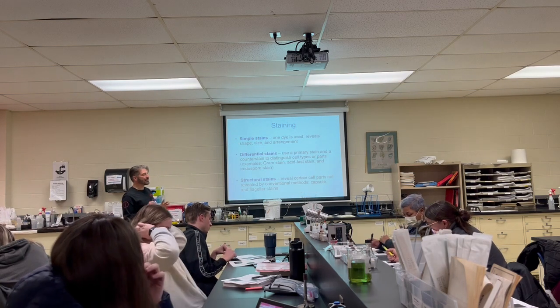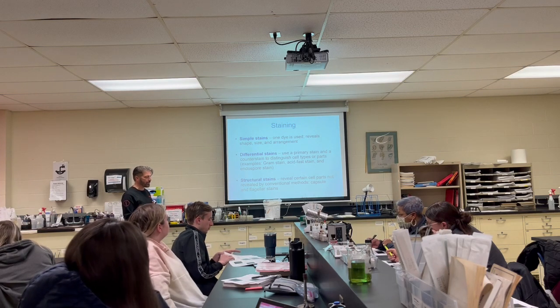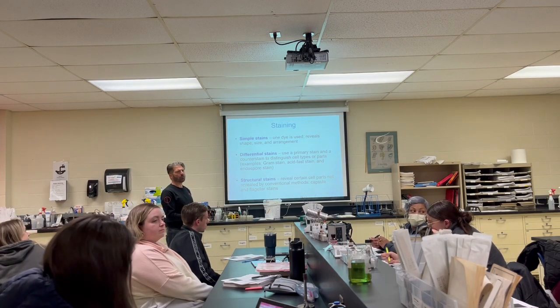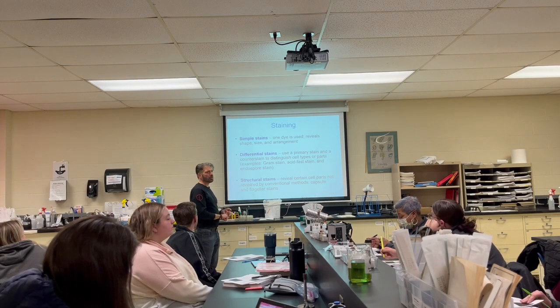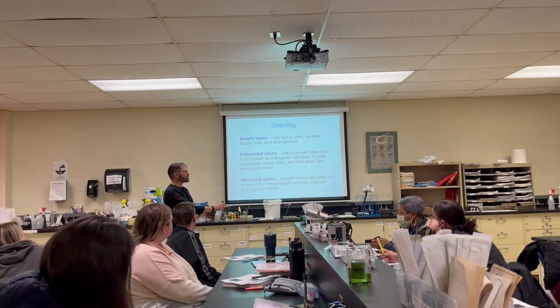All right, so today we're going to be doing a simple stain in lab, which just means you can take your pick of anything over there. Green, pink, purple, whatever. I think we have methylene blue, we should have safranin, crystal violet, whatever color you want. I'm just going to do a basic stain, and that'll just let us know the shape. All right.